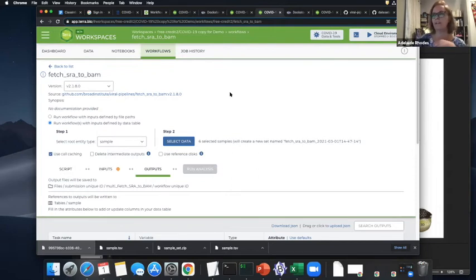That makes sense. And I could even have an index in the data table possibly that has the date. And then I could say, I want to rerun everything from July, or things changed in New York City, we think, so I'm going to just grab the samples. I'll get the SRR list from the metadata in BigQuery and only run things in New York City since this month, just to see if I'm detecting the new variant type, right? Those are the kinds of things that people who want to use this workspace on Terra are probably going to want to do, right?